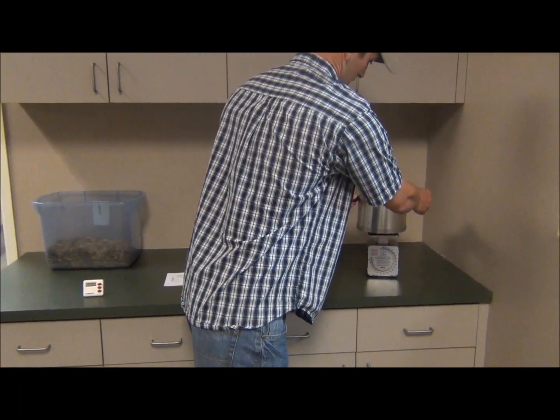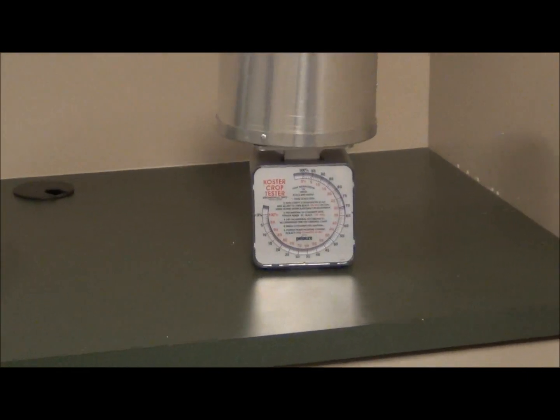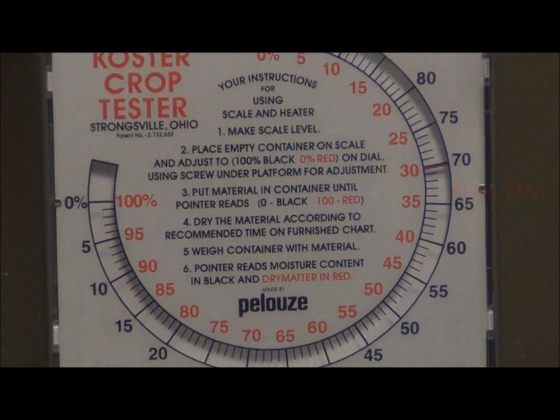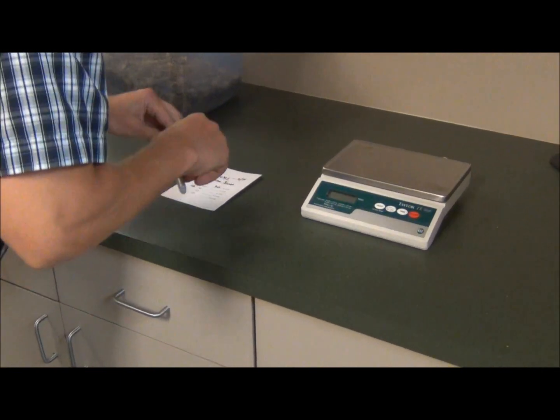After the first 30 minute period has been completed, place the sample onto the scale and record the weight. The pointer reads moisture content in black and dry matter in red. In this case, the dry matter is 30%. Record this number along with the time associated.